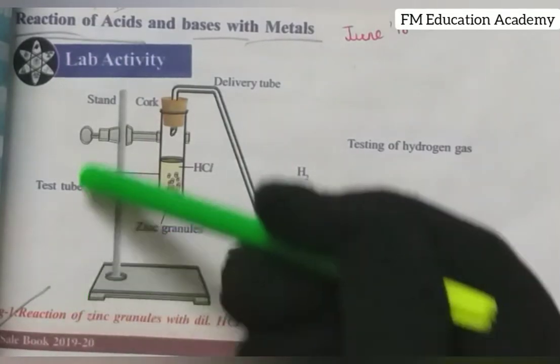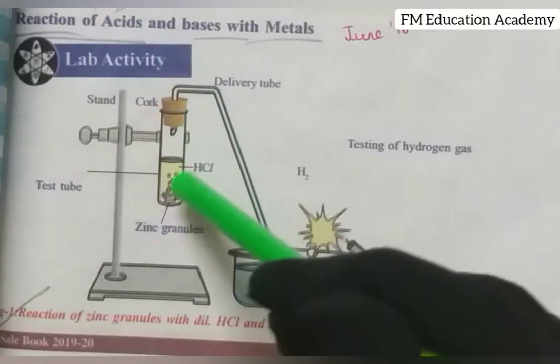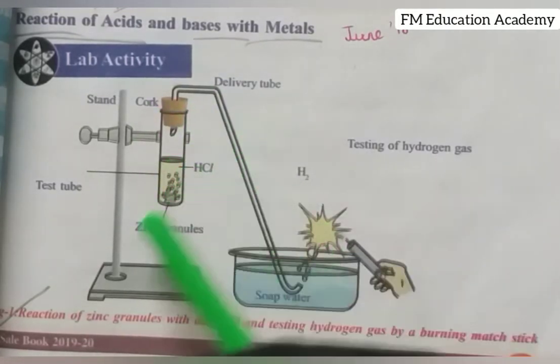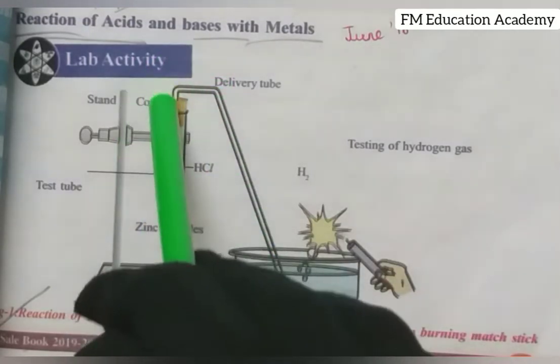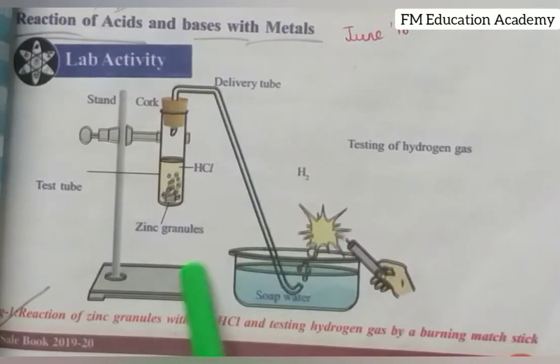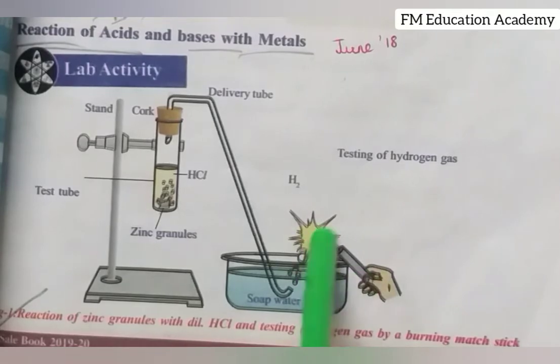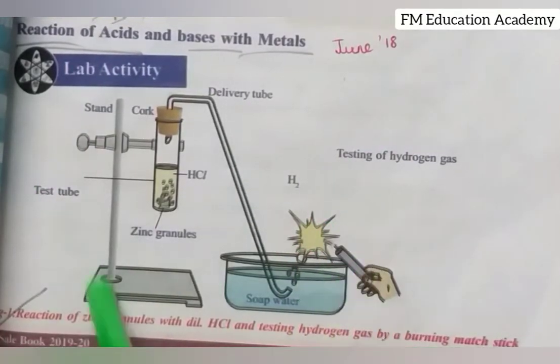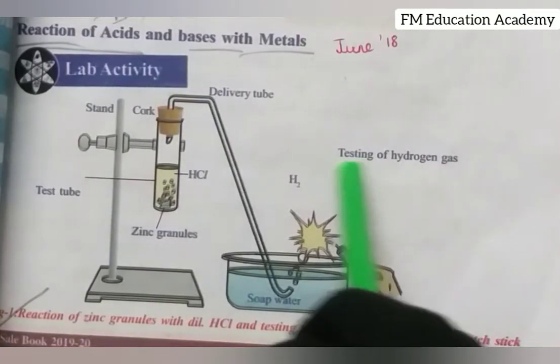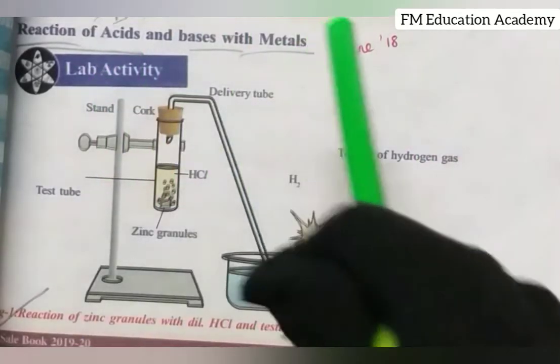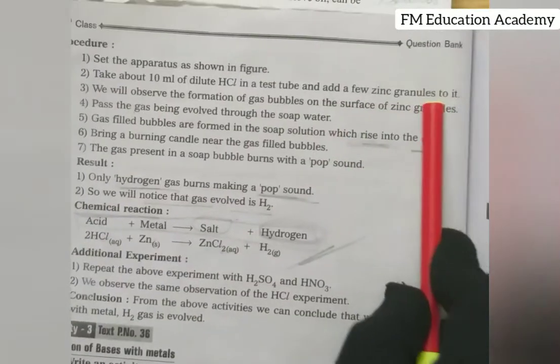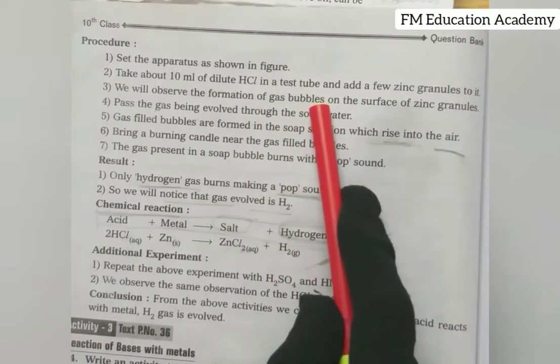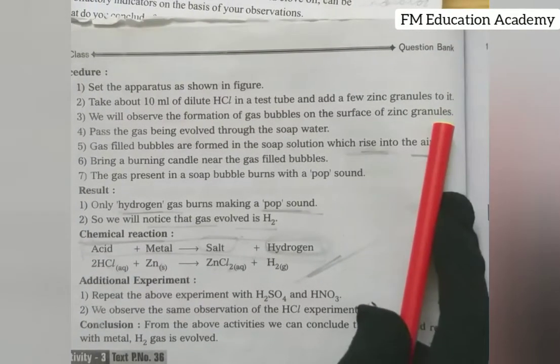Now for the setup: we attach the test tube to the holder on the stand. Inside the test tube we put about 10 ml of dilute HCl and add a few zinc granules. We cover the test tube with a cork, make a hole in the cork, and connect the delivery tube through it. The delivery tube passes through the soap water in the glass trough. Initially, do not bring the candle close.